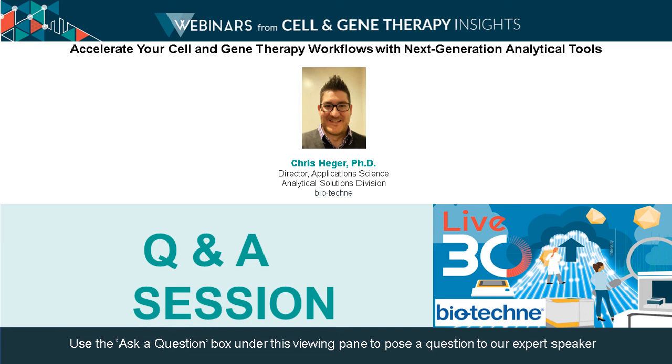Yeah, hi. That's a good question. I think this is referring to our Simple Western data that I showed, where I showed a number of serotypes. At this point, it is a new assay. The application note actually just published yesterday. But we have thus far looked at one pharmaceutical AAV that's a non-wild type variant, if you will, and that also works well with the empty full method. So we're encouraged that in that first try with a non-wild type variant we had that success, and we look forward to others testing it out with their program material soon.